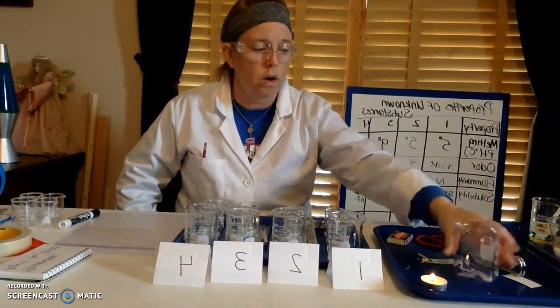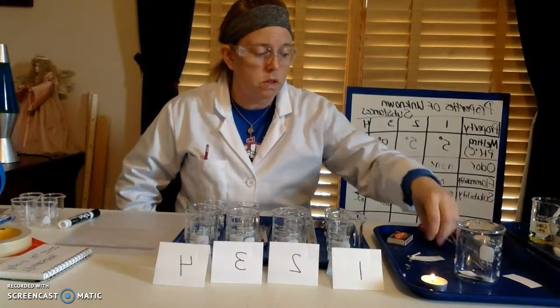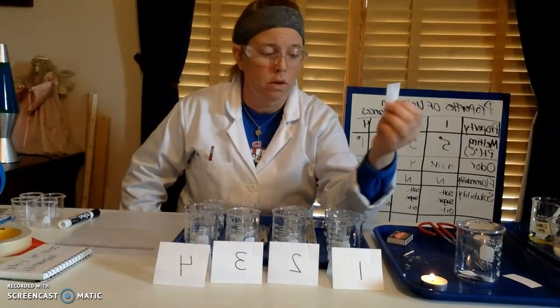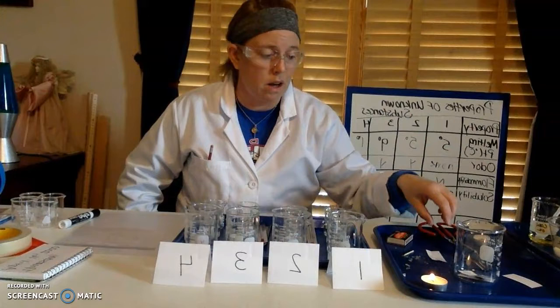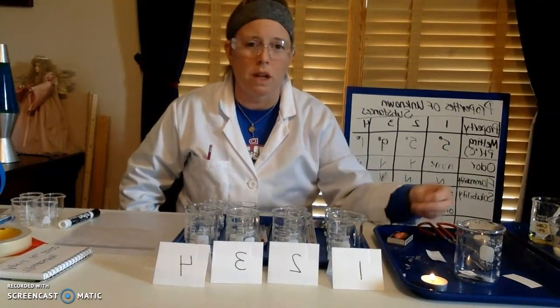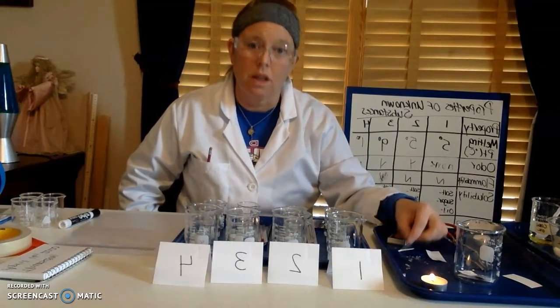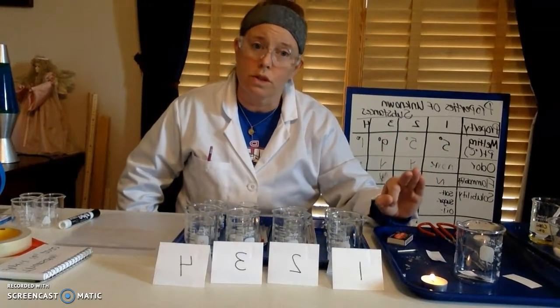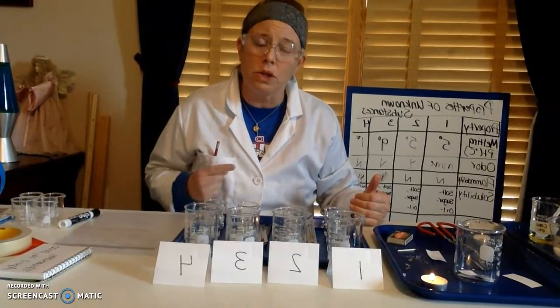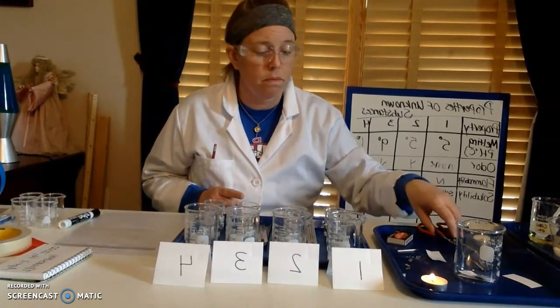So if I pour my contents, this was liquid 1 and 2. Did this change the paper? This is just paper. Okay? So was that a chemical change? And then you can't see it, I'm just going to point to it with my matchstick. This here, all this stuff down here, is ashes. That was number 3. So did a chemical or physical change occur? Again, our driving question this week is how do I determine if a chemical change or reaction has occurred?